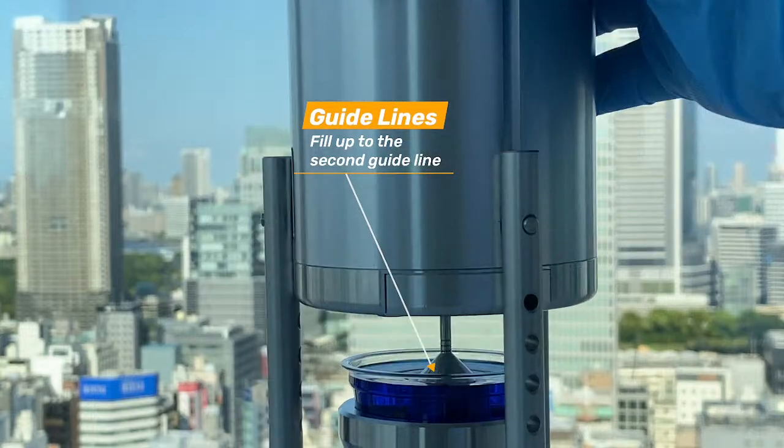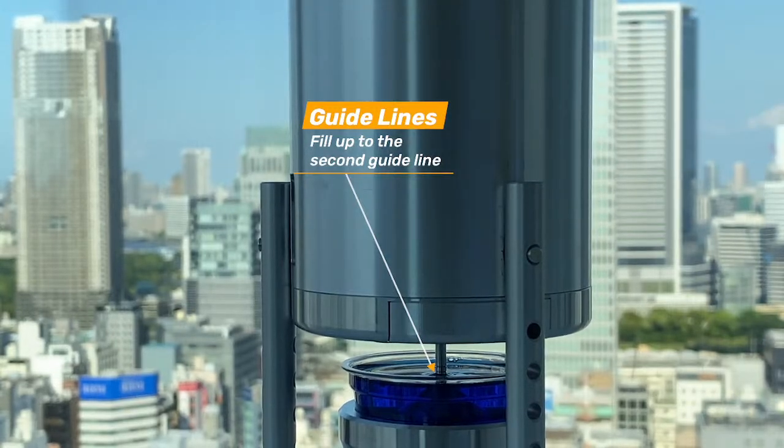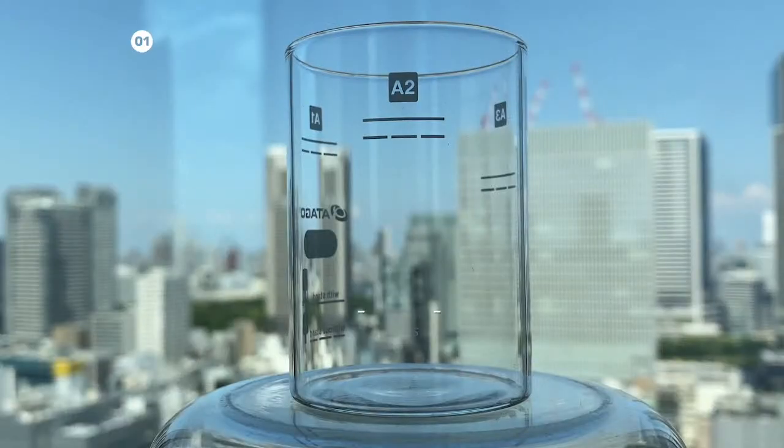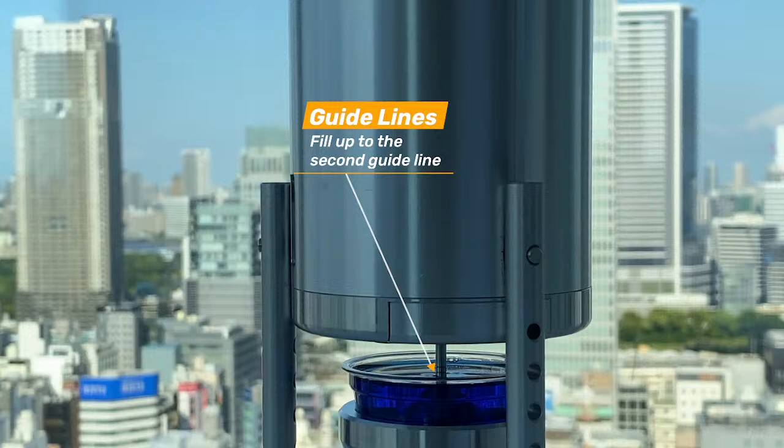So these spindles, as you can see, have 3 different guidelines at the base, and you want to put enough sample so it reaches the middle guideline. And here, this option is your cup adapter.